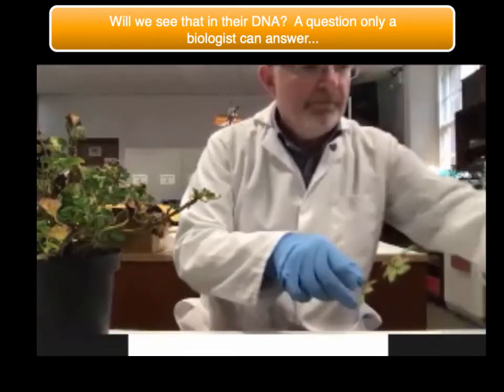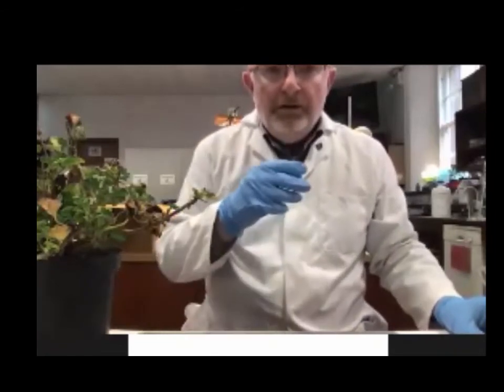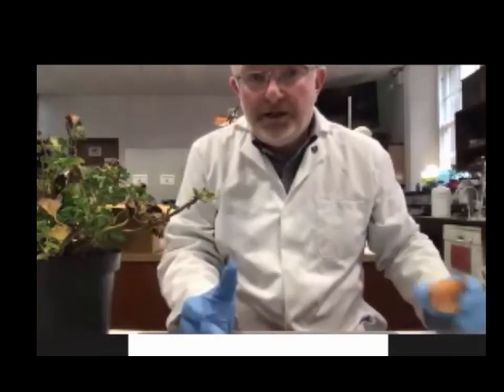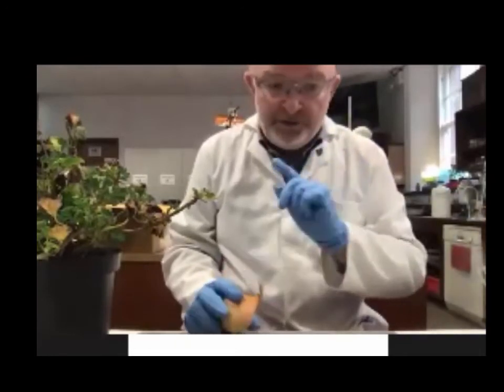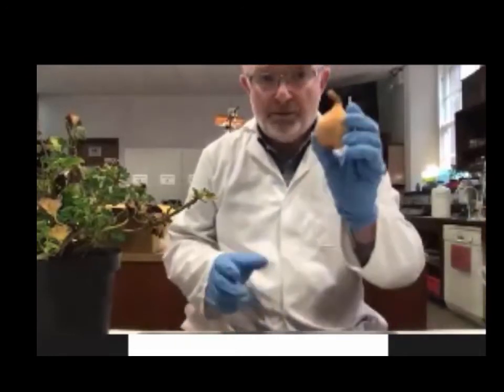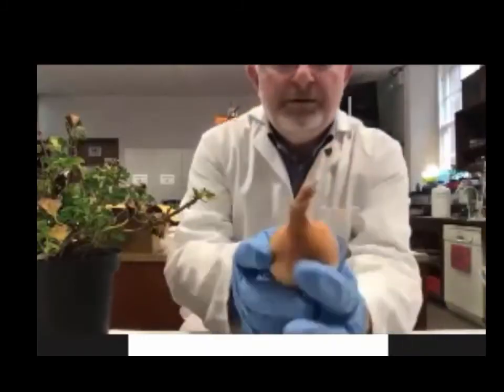Now, if you look at your biology textbook, that's not how you extract DNA, and as well as that, you're not going to look at it and do anything with it. But that's what we're going to do. So we've got an onion.